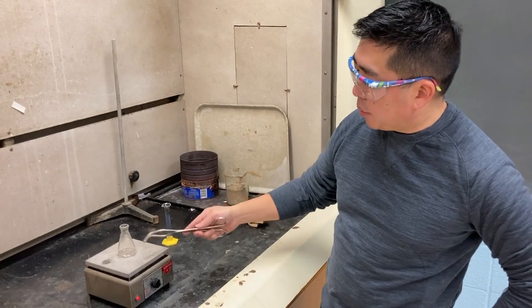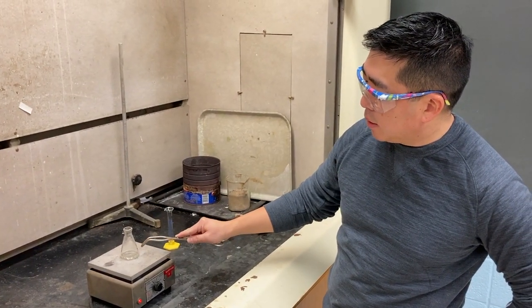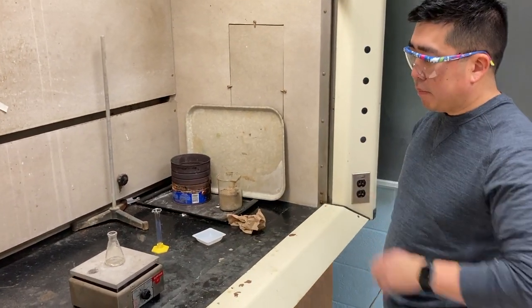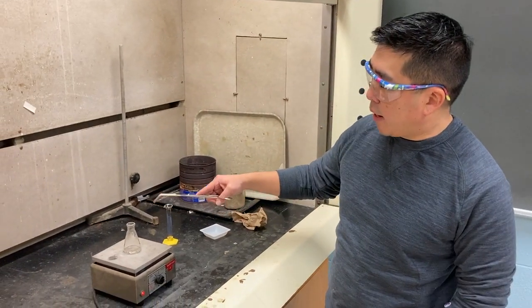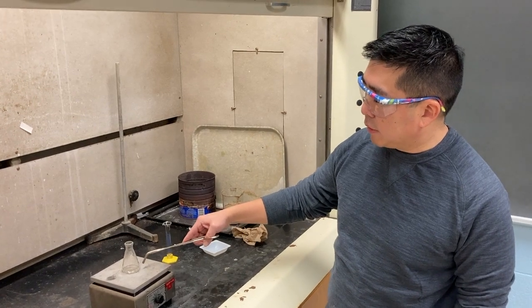So once this completely dries out and all the water leaves, what's going to be left is the magnesium compound with chlorine. So how do we know that it's going to be a magnesium chloride compound? Because the chlorine reacted and it's going to bond with the magnesium, even though right now they're dissolved and you don't see them.